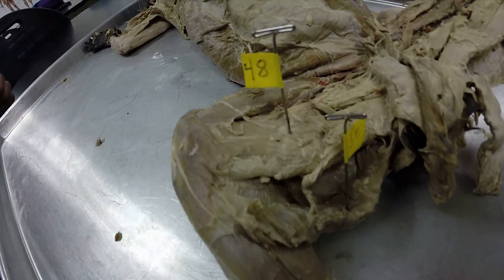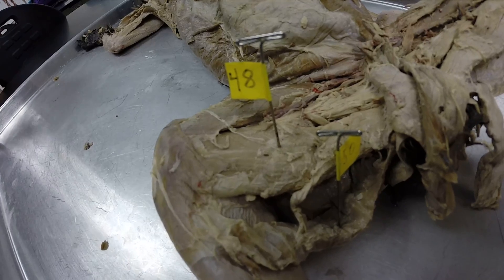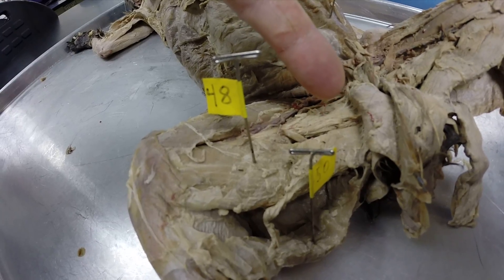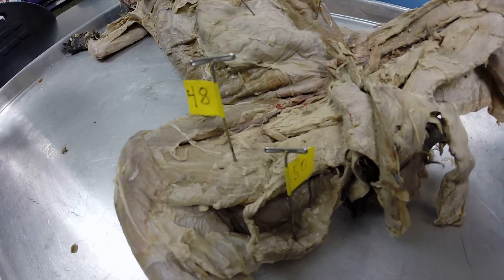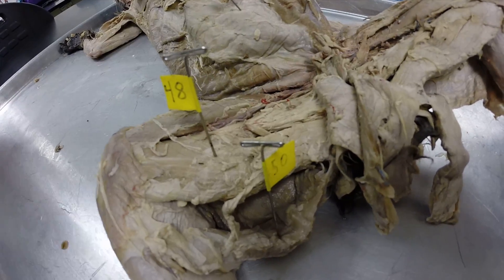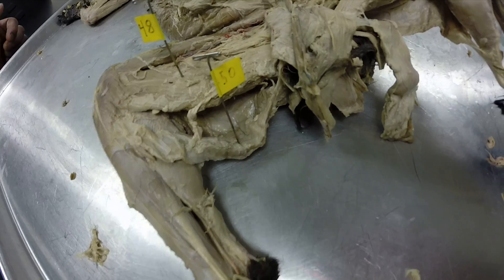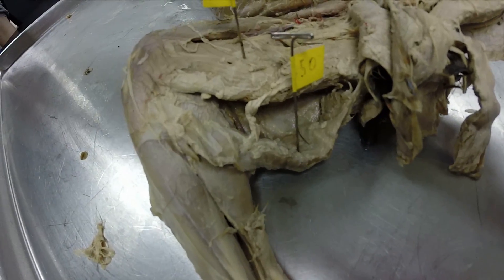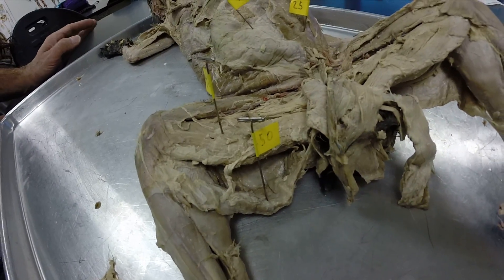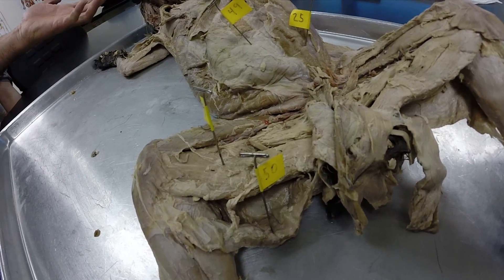Number 48 — let's say I completely don't know it. What do I do? I look at neighboring muscles. This one's the adductor femoris. And down here is our semitendinosus. So this is a good one — if you learned them in order and you know the muscle next to it, you may be able to figure out that this is the semimembranosus. If you don't know a muscle, name the muscle next to it. If you do know a muscle, name the muscle next to it to check yourself.